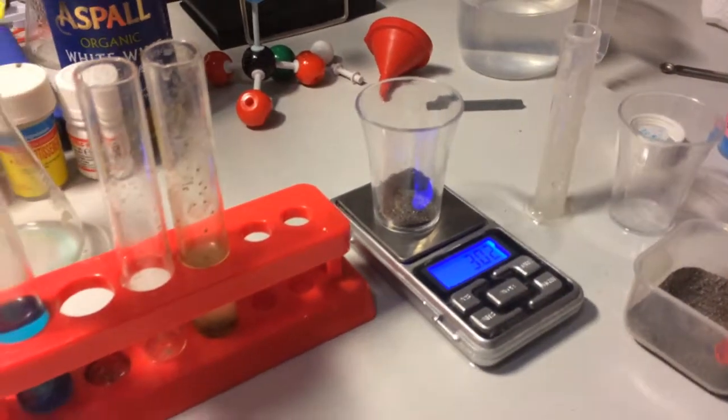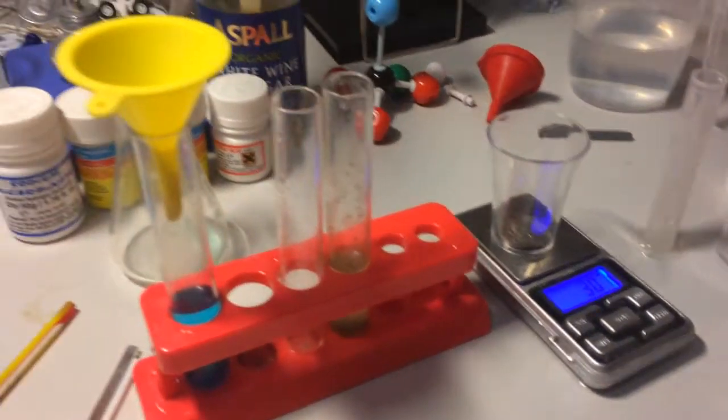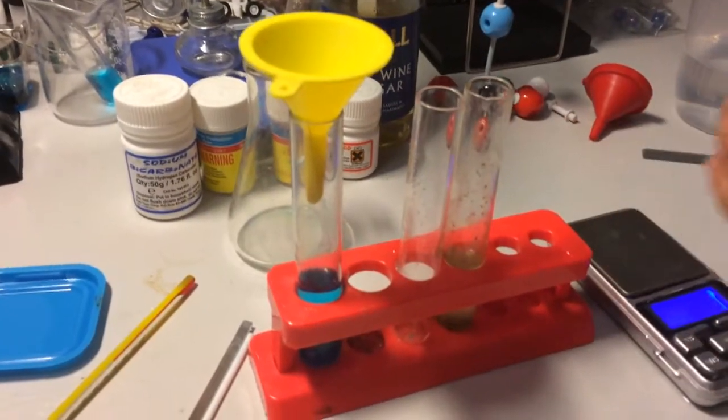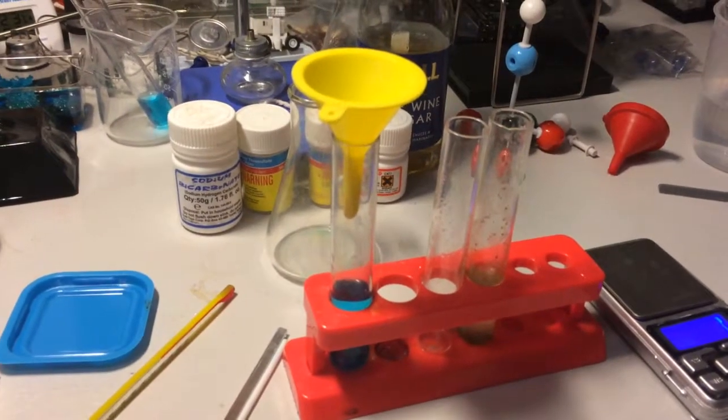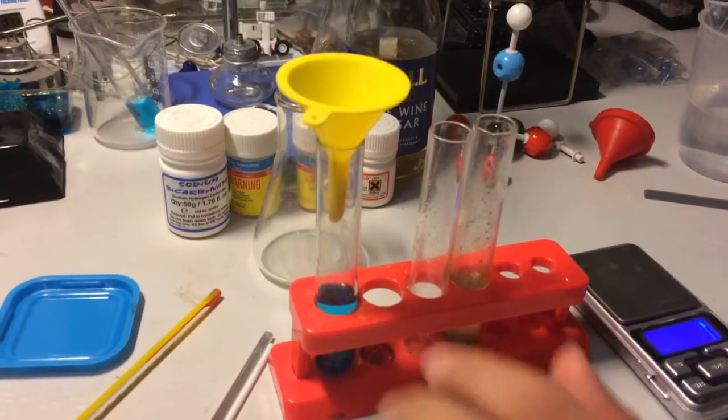Now that we have got approximately 3 grams of iron filings, we can now add it to the copper sulphate solution to see what happens.